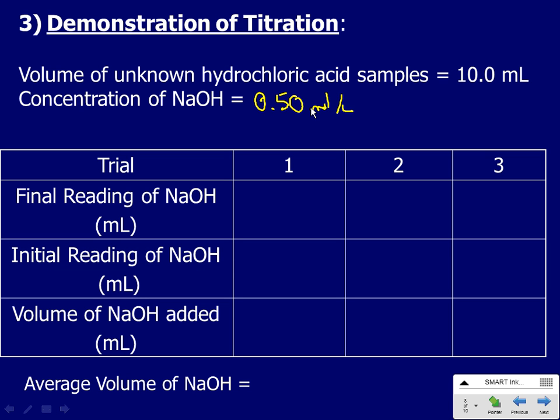Come on, a little bit more, you turkey. Right there. So, finger on tight. Slide it up the side so no drips stick. Straight into there. Let it go. 10 milliliters. Transfer it.